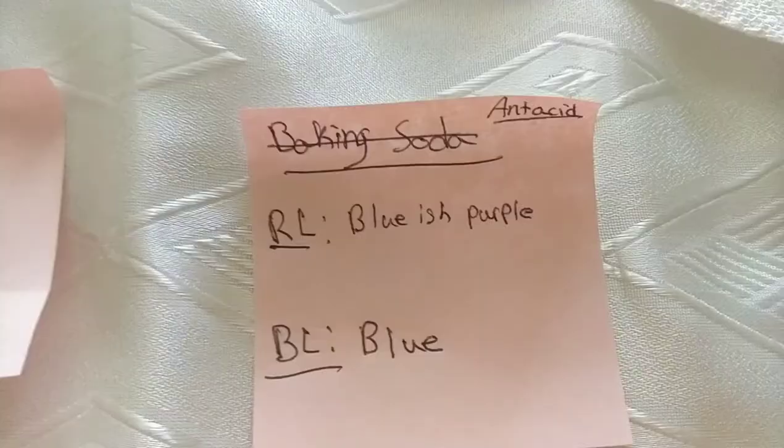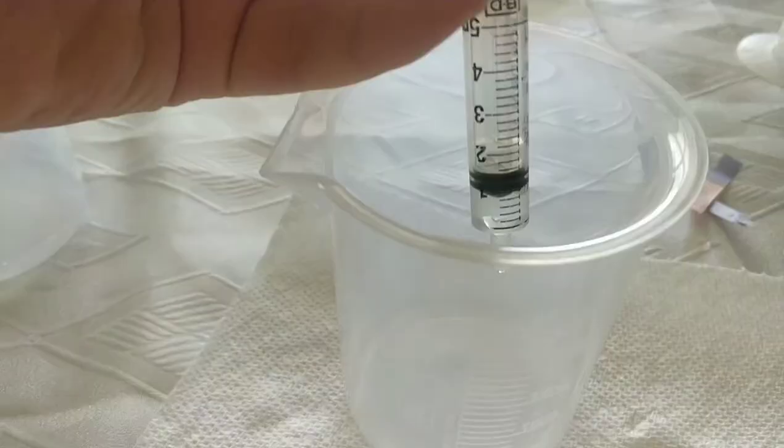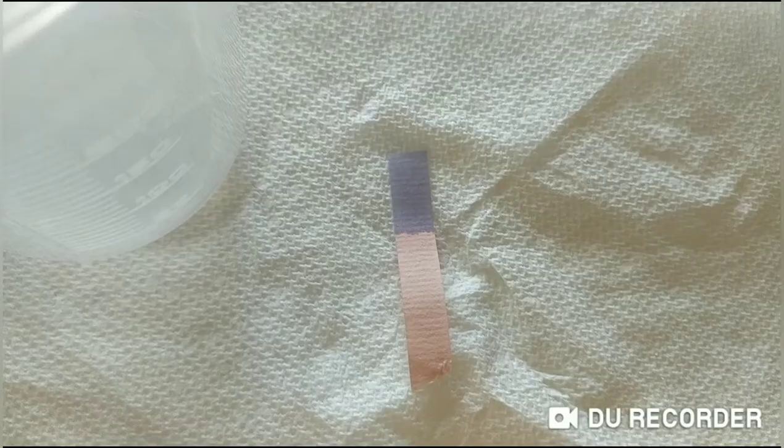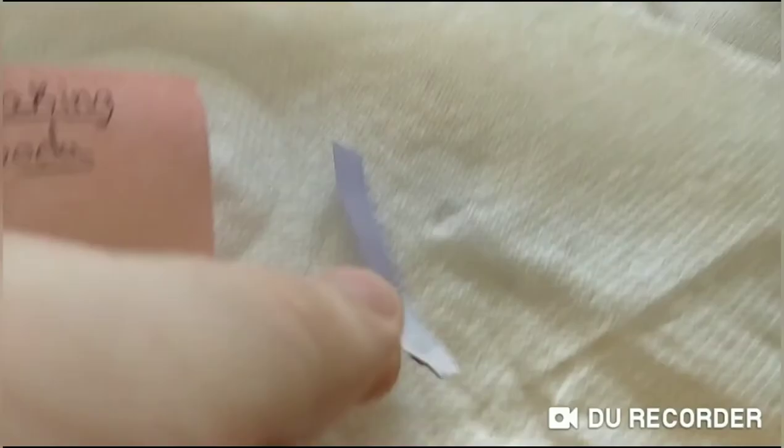I just realized I switched it — I tested the antacid first. I've cleaned out the beaker so we can use it to test the baking soda. I'll measure out one milliliter of the solution and test it with the different litmus papers. I've also cleaned out the syringe. The red litmus paper in the baking soda solution turned blue, and after testing with the blue litmus paper it stayed blue.